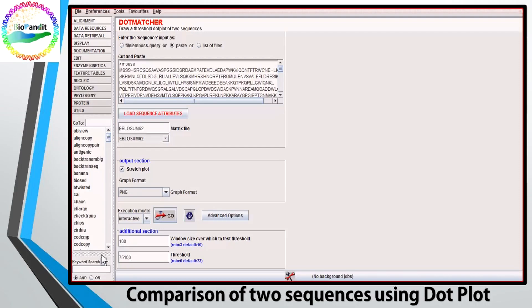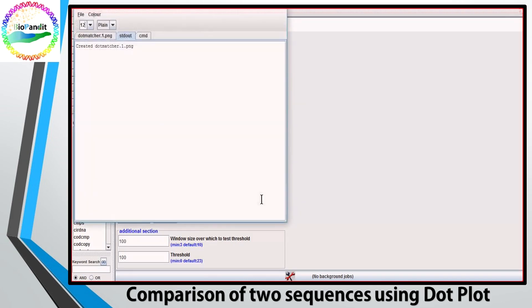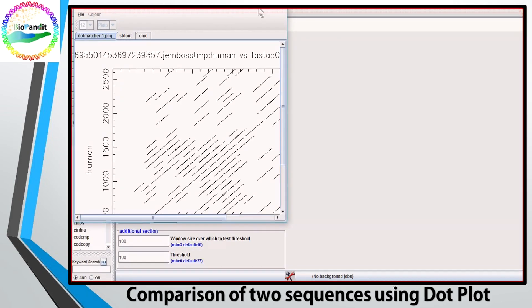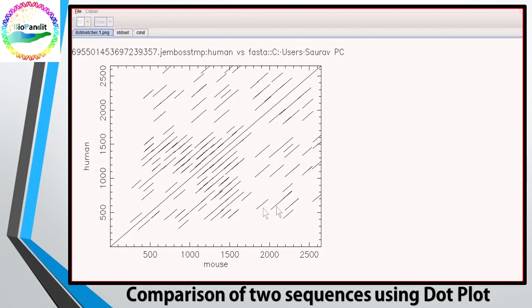And if you elevate the identity threshold to 100%, the noise reduces even more. And you will still see a high degree of sequence similarity.